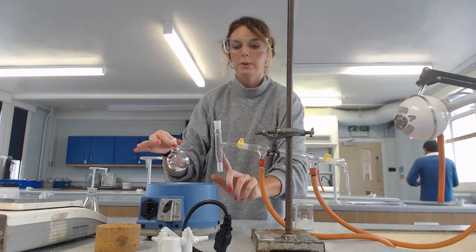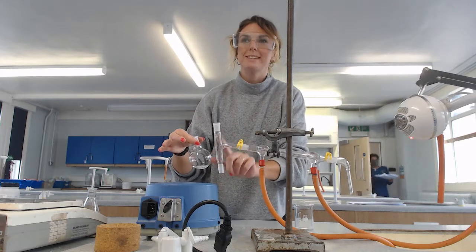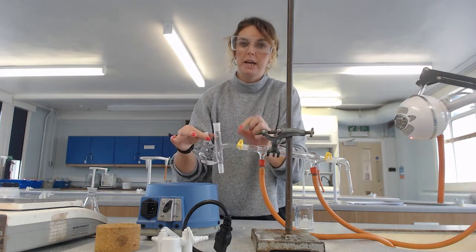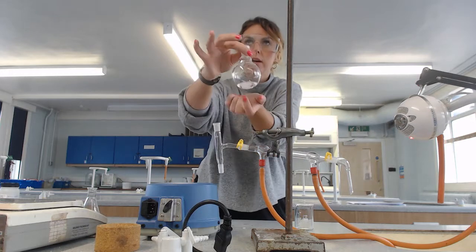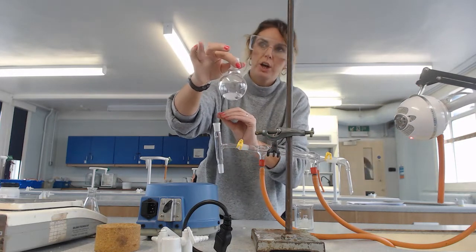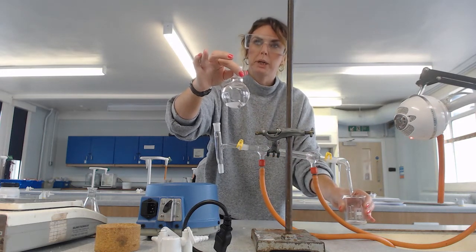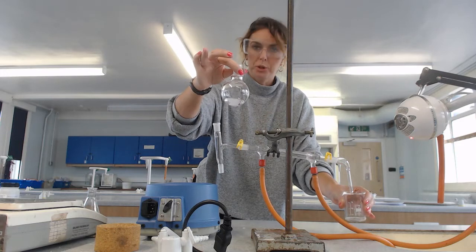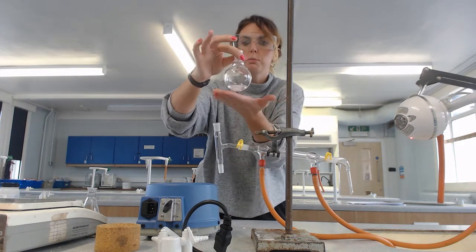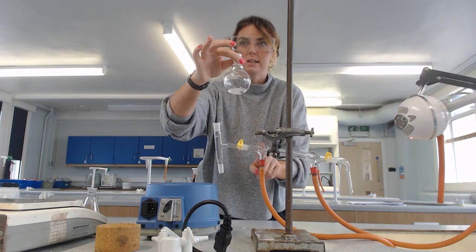We don't want it boiling so vigorously that it comes up the tube and into the condenser, because if that happens we've got immediate contamination. If there are any impurities in here, they'll come up and go down into the condenser and into our collection flask where we want to collect our pure product. We want to ensure a smooth boil so that only the vapor comes up and out into the condenser.